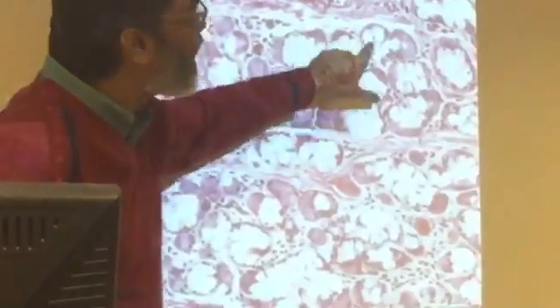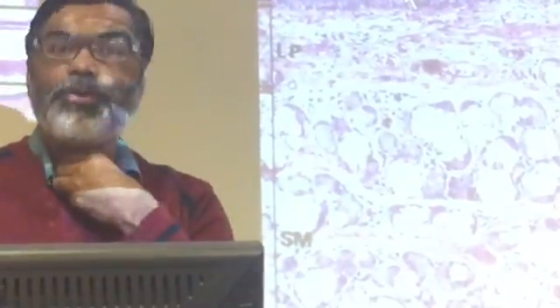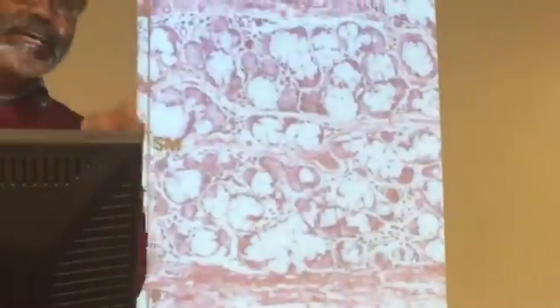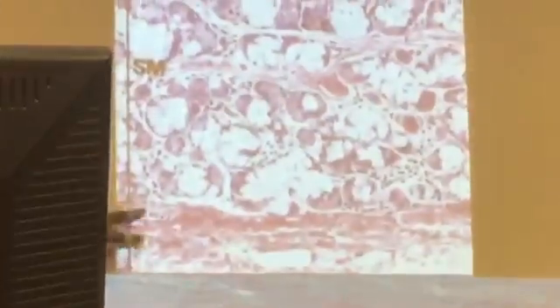So these white glands are mucus glands, and these dark glands are serous glands. So we have what type of glands? Seromucous glands. In the respiratory system, especially in the trachea, we have seromucous glands. As we go down the trachea, this whole thing here is the trachea, the number of glands will decrease. And then just below the submucosa, you can see this.